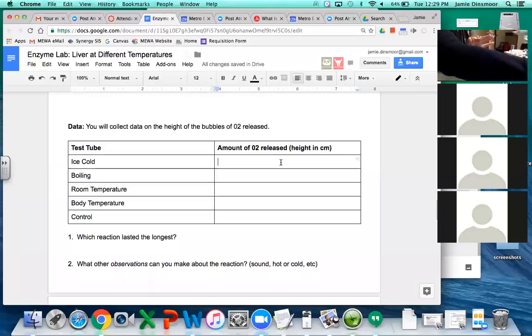But we have our 5 milliliters of hydrogen peroxide. We have our chicken liver at room temperature. We're going to add it and we're going to be measuring our bubbles. Hopefully you guys can see it. It's bubbling like crazy. It's going to go over the top. It's going to spill. Notice how vigorously it's bubbling. Does it feel warmer? Yeah, you can feel the heat a little bit from the reaction. It's bubbling over.